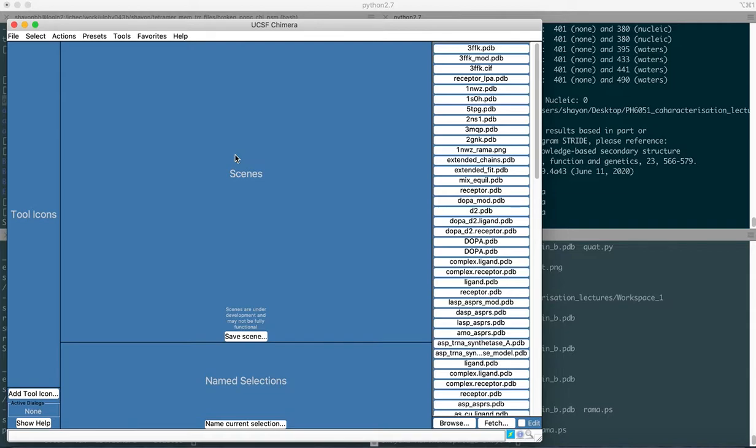In our case, with the gelsolin-actin complex, you find that the calcium ions are bound to the gelsolin moiety, which further binds to the actin and controls the growth of the actin filaments. This is a biomarker for ovarian cancer.